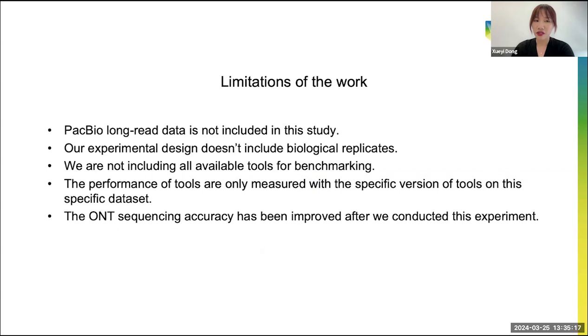And I found out that in our work, there are still limitations. So firstly, in this work, we only used the Illumina short read and the Nanopore long read sequencing, while PacBio long read sequencing is also very popular, but we are not including it in this study.